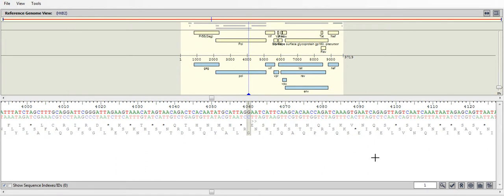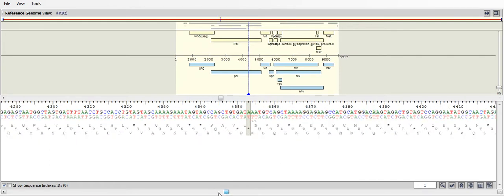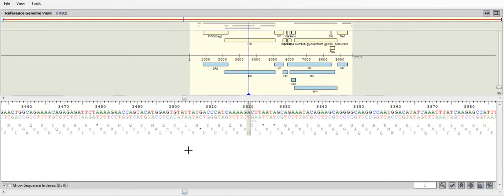At the bottom, we have the reference sequence, with the scales showing the reference nucleotide base position. The bases on the forward strand are shown at the top, with the corresponding complement strand below with the bases slightly faded. We also have the 3 reading frames of the amino acids. Each residue is centered to the codon, i.e. in the middle of the 3 nucleotide bases.